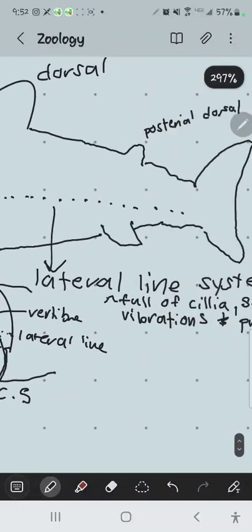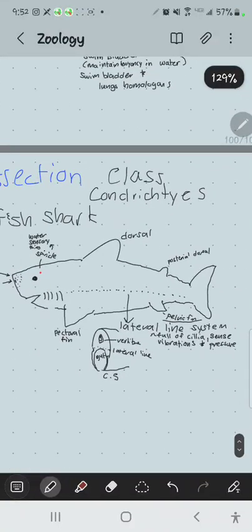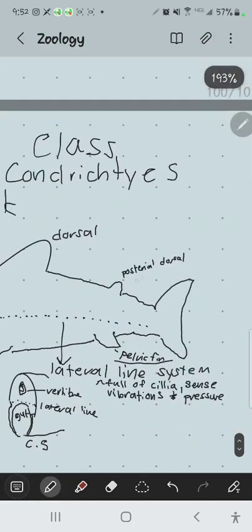The pectoral fins are gone on this one, the pelvic fins are there. But then we're going to see that amphibians have modified these into legs for walking on land. So the homology of fins versus tetrapod, four-legged vertebrates, is interesting. It has basically the same basic structures, at least with the bony fins, not so much with the sharks.